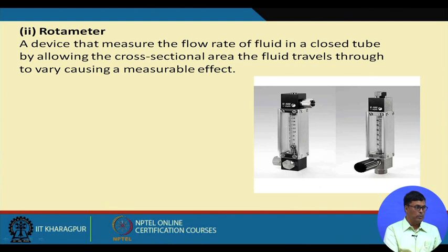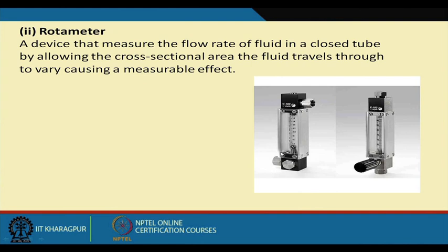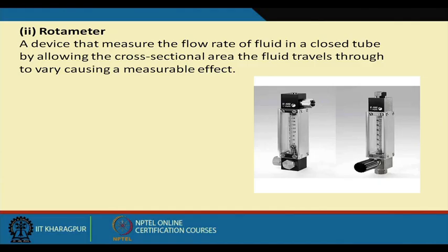So whenever we use any kind of rotameter, first we shall have to remember, we shall have to calibrate this rotameter, because any kind of meter that we use for the fermentation industry, we shall have to calibrate first. Calibration means you have to find out whether the reading that is showing in the meter is proper or not. So how can you calibrate that? With the help of a gas flow meter. With a gas flow meter you can find out what is the flow rate of air.